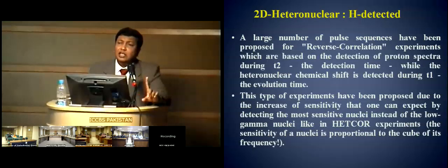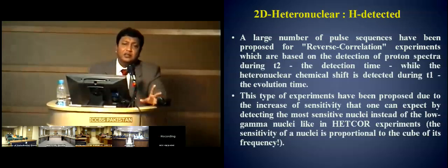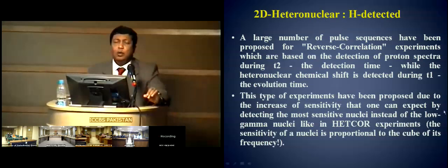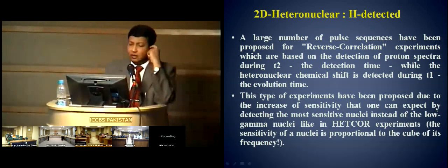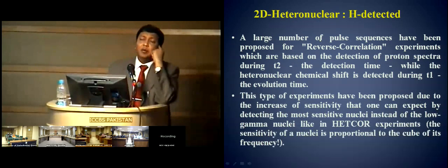People developed large hardware, large computers, new pulse sequences, everything to increase the sensitivity. The whole concept of pulse Fourier transformation NMR spectroscopy, polarization transfer, and even inverse polarization transfer is for increasing the sensitivity of this very weak carbon-13, a very important nucleus on which most of the biochemicals and all the organic compounds are based.